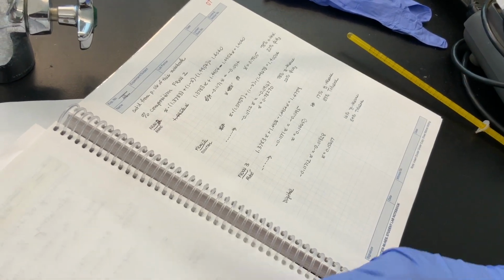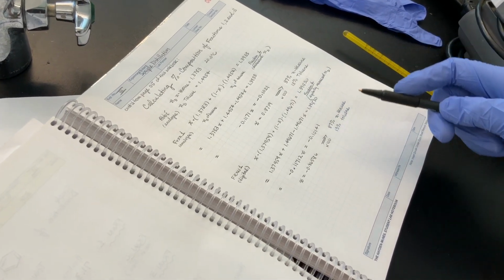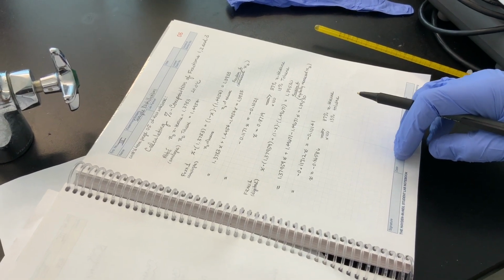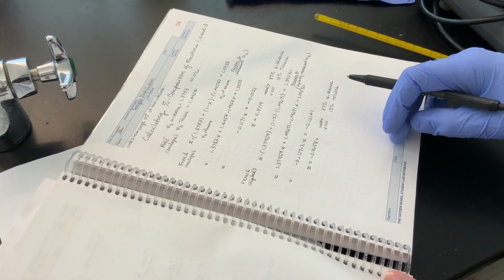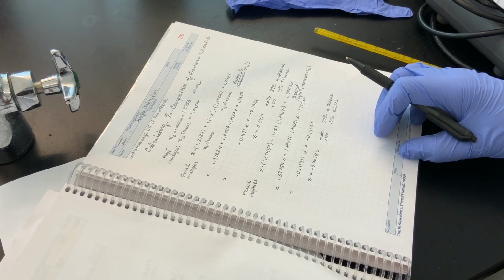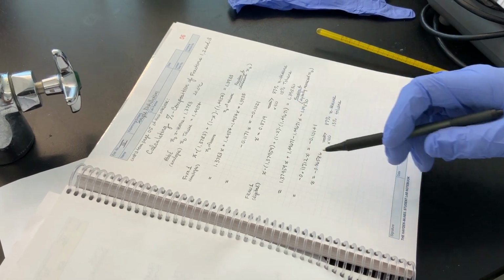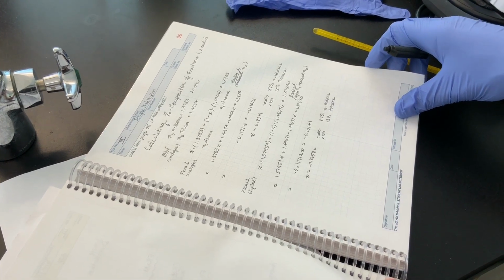And then the first fraction that came off was the lower boiling solvent, normal hexane, at 87% composition. So you should be able to understand these calculations, and given some examples either on a quiz or a worksheet, be able to illustrate to your instructor that you are able to manipulate the equation and rationalize why these numbers worked out this way. Once again, it makes sense. Fraction 1 is comprised of mainly the lower boiling solvent, and the opposite case is true for fraction 3. It's comprised of mainly the higher boiling solvent. And that's all.